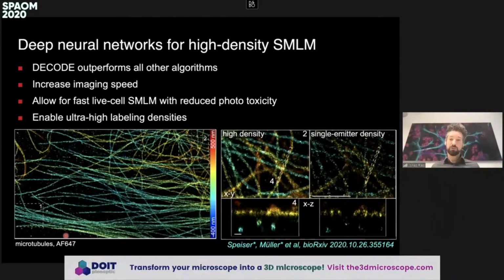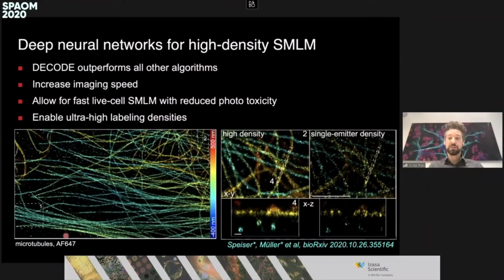And this is because these fluorophores have a tendency to go back into the bright state spontaneously or activated by the red laser itself. What we would usually do for these samples is to use a pre-bleaching step. That is to really hit the sample for many minutes with a high red laser power, maybe with some UV laser power, until the fluorophores are bleached and we reach the single molecule blinking regime.